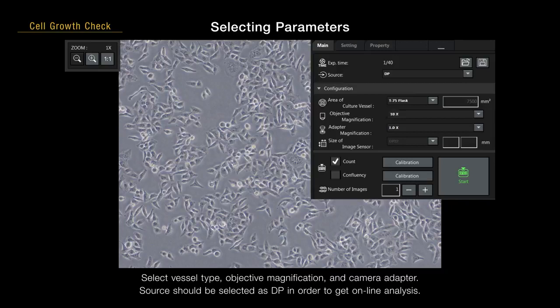Select vessel type, objective magnification, and camera adapter. Source should be selected as DP in order to get online analysis.